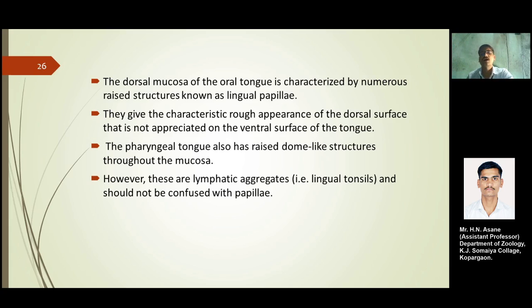However, these are lymphatic aggregates, the lingual tonsils, and should not be confused with the papillae. Papillae are different structures than tonsils.